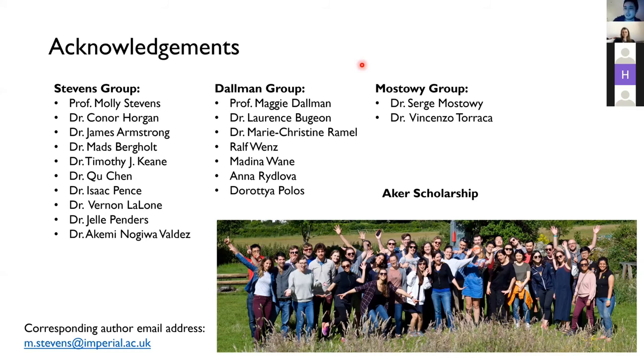Okay, yeah, that makes perfect sense. And I think we have a follow-up question from Matthias, who says, nice paper, Hakon. For organ development tracking, I assume keeping the same zebrafish alive over longer periods of time is important. What are the challenges associated with this, and how suitable are standard optical microscopy setups if you want to combine these with Raman imaging? You mean combine in terms of performing correlative imaging?